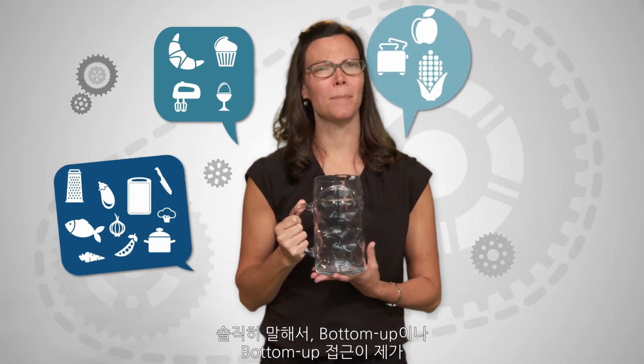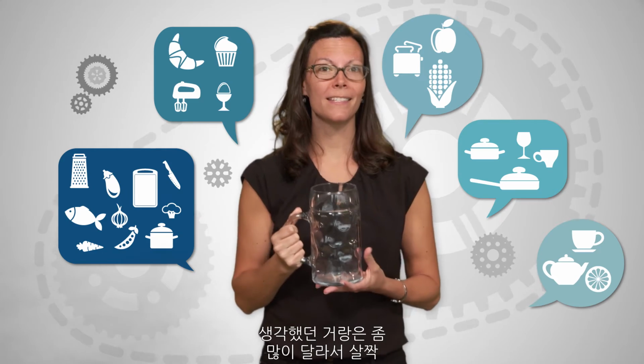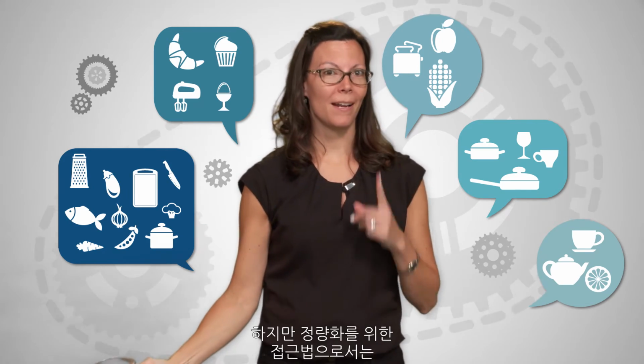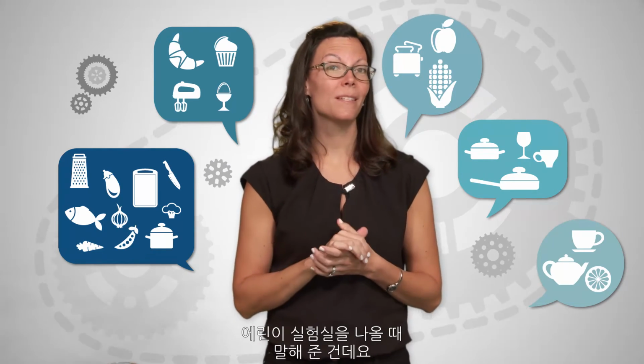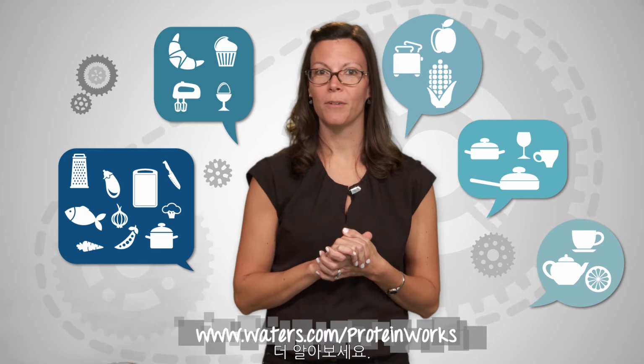Well, I have to admit that I'm a little disappointed that the bottoms-up or bottom-up approach is not exactly what I thought it would be, but it does look like a valuable approach for protein quantification. Good news is that Erin told me on the way out of the lab that she has done some pretty comprehensive webinars on this topic. So check out the links below to learn more about the surrogate peptide approach and get additional information.